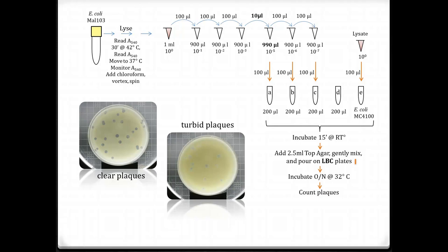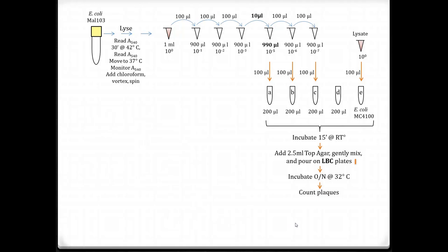cells around the cells that it originally infected. These are plaques as well, but because not all of the cells were killed, some are still alive, though infected. That plaque is cloudy. There's still cells alive in there. Here, none of them are alive. Clear plaque, cloudy plaque. So look at your plaque and see if you can see through it. All right. So that's part two.